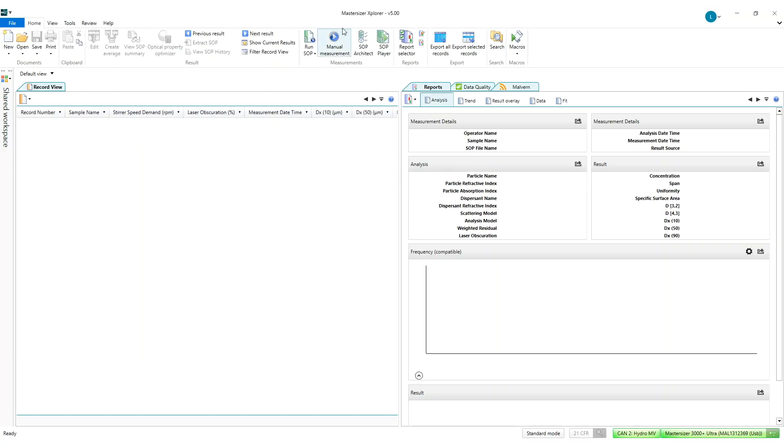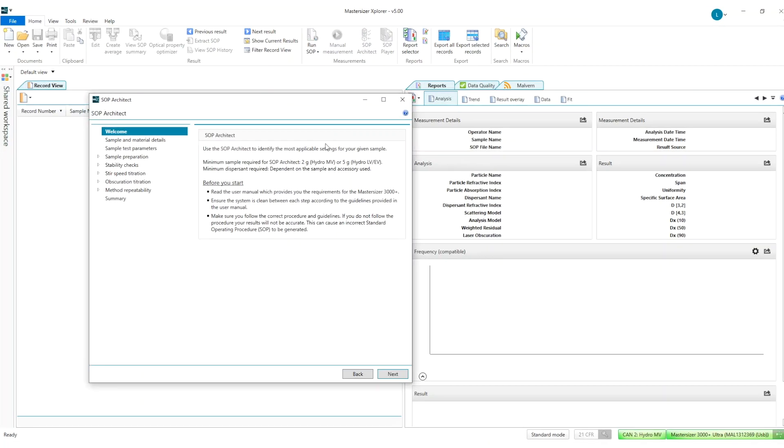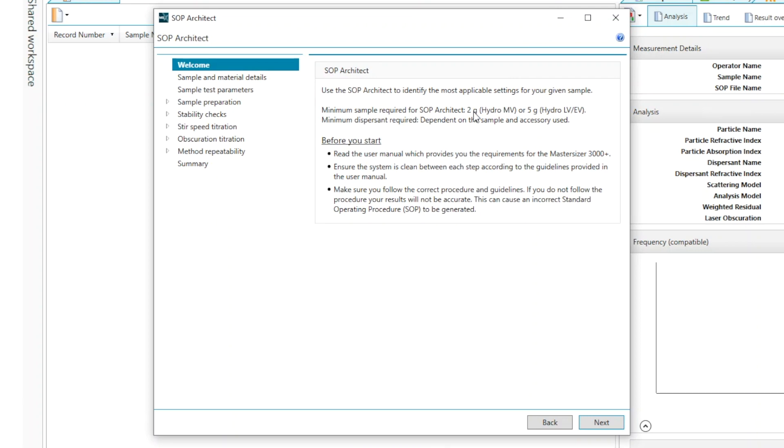So I'll now open up SOP Architect on the Mastersizer Explorer software. SOP Architect is a guided workflow that's going to take us through the necessary steps to ensure that we have an ideal method developed for measuring our sample.